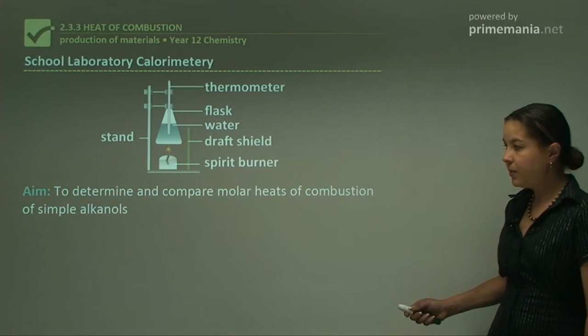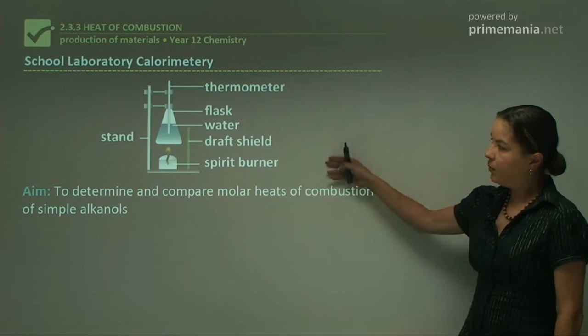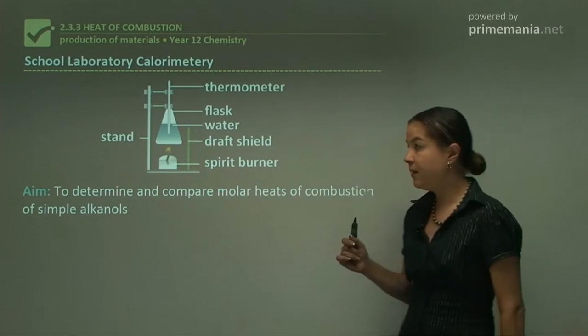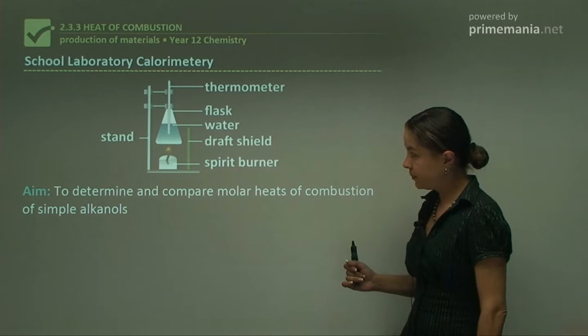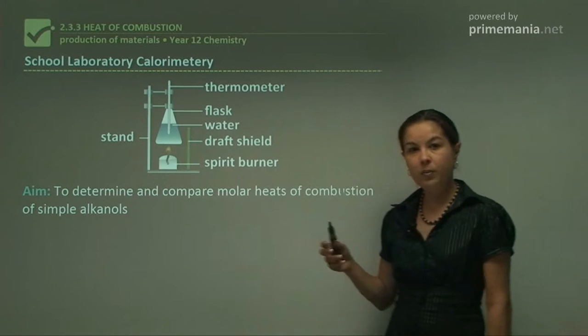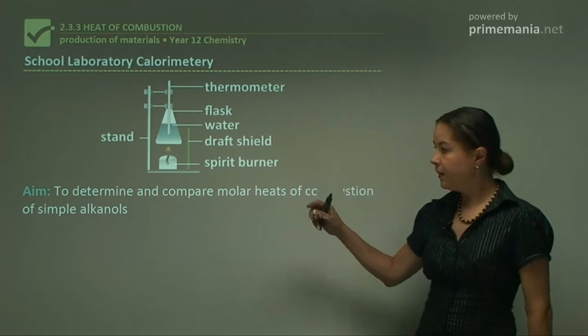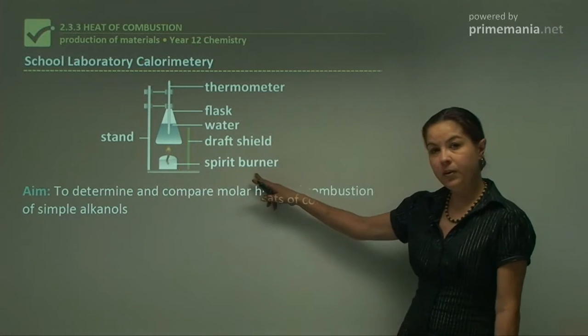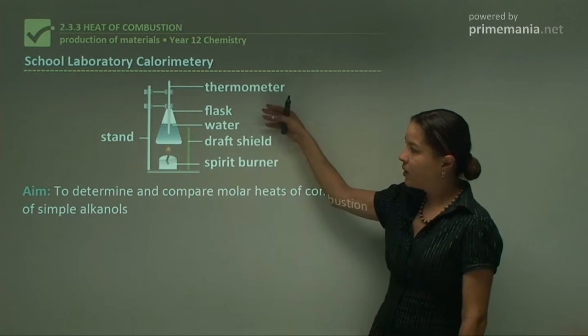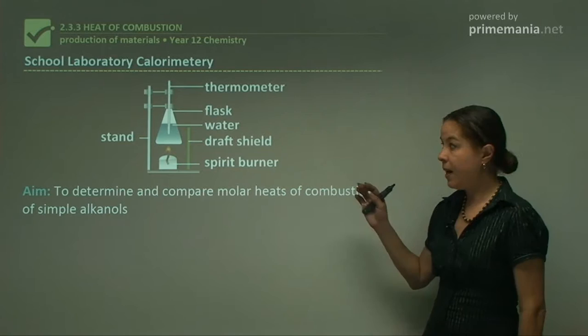Our aim for this experiment is to determine and compare the molar heats of combustion of simple alkanols. Just to quickly recap, what we have here is our apparatus. We have a stand with a clamp which is holding a flask here, in this case a conical flask, and this is our calorimeter. We also have a thermometer to measure the temperature difference in the water, and the water will be of constant volume. We have to use a draft shield because we're burning the alkanols in this little spirit burner, and if we have too much draft or wind, you'll have less reliable heat source. That's our basic calorimetry apparatus for this experiment.